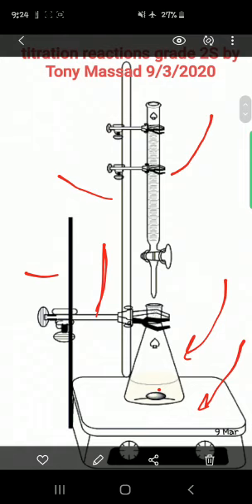Let us just consider the titration between potassium permanganate solution represented by the MnO4- ion, with the K+ being a spectator ion, and another solution of Fe2+ 2Cl-, represented by the Fe2+ ion, placed in the flask or the beaker down below. Now, a certain volume must be taken of the Fe2+ 2Cl- solution and poured into the flask. We need to use the volumetric pipette because of its high accuracy. So we measure a certain volume of that solution and pour it in the flask or in the beaker.